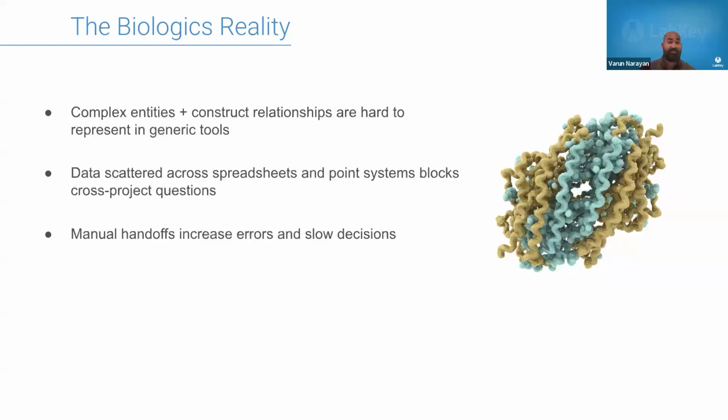Each extra step introduces yet another opportunity for human error and slows things down even further. Especially when it comes time to quickly identify what's working, what's not, what's viable, and what to pursue, these slowdowns can be incredibly detrimental to your process.